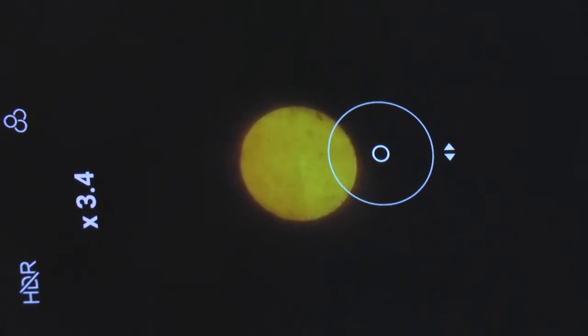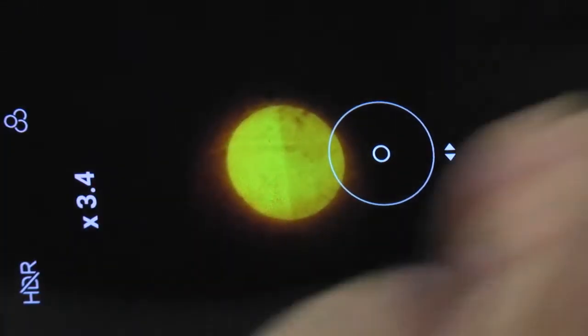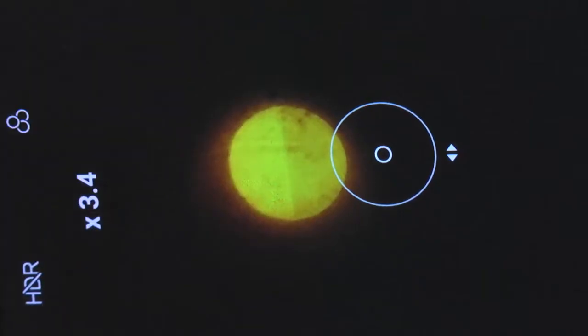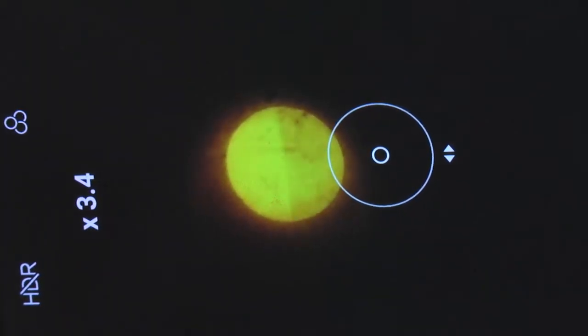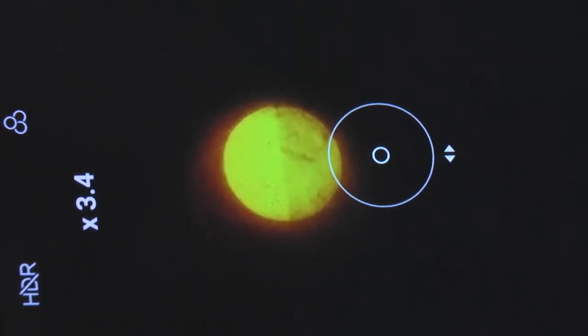And then I should get the half is bright and half is dark. Yes, I lost it. No, I think this is the position. This half is dark and this half is bright. Okay, so this third time I got. Now third time I should get the uniform one.